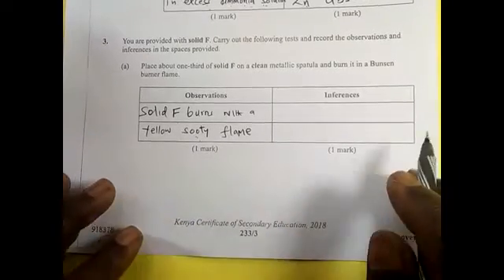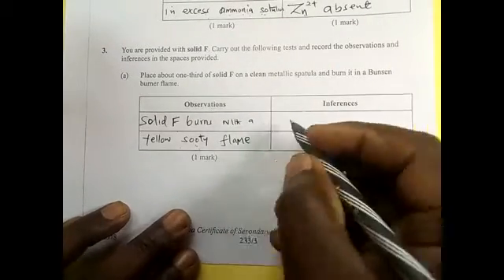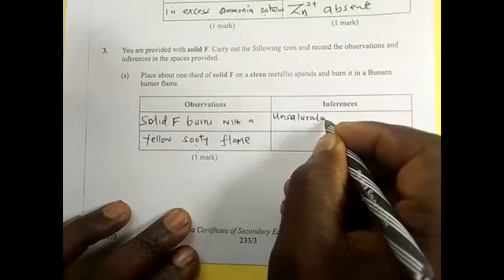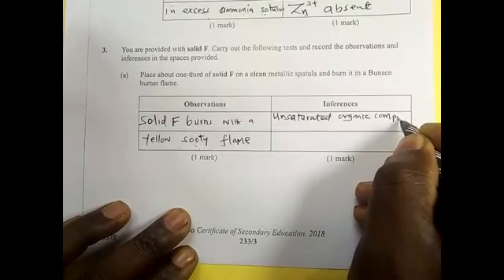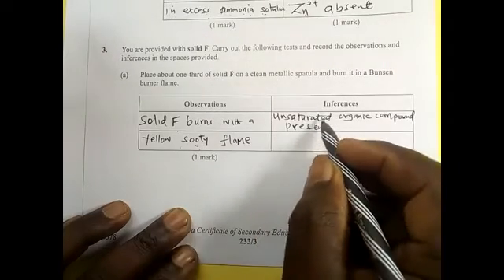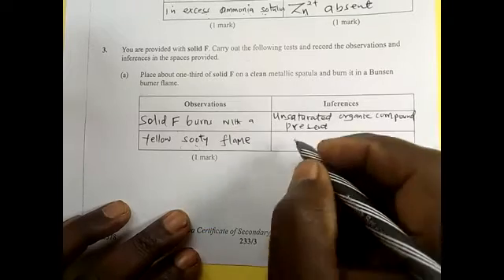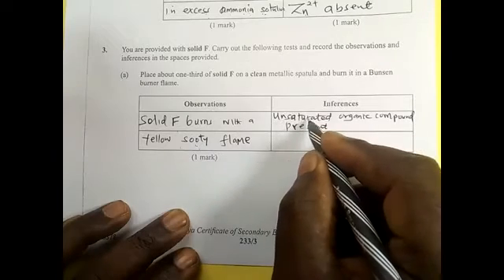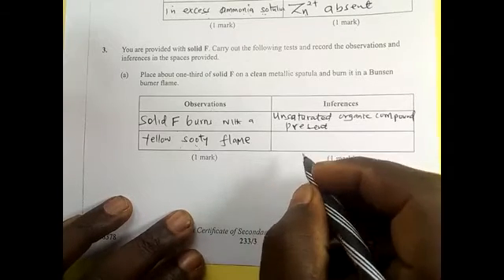So what is the inference? This means that an unsaturated organic compound is present. The unsaturated, we know we have 2 of them, that is the triple bond and the double bond, so you can also say the alkene and the alkyne. If you can't remember unsaturated organic compound, just write the functional groups of the alkene and the alkyne.